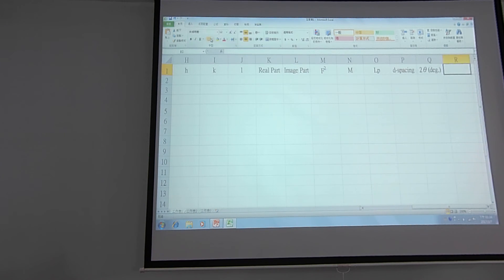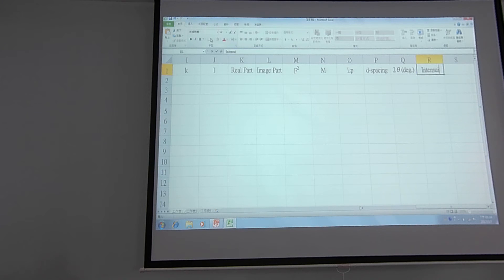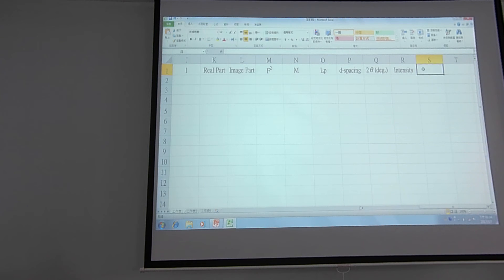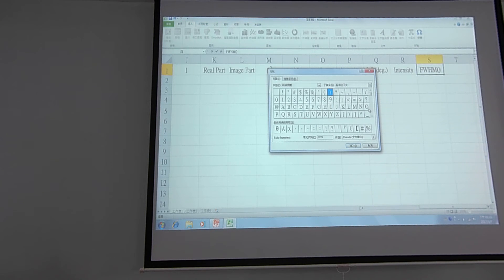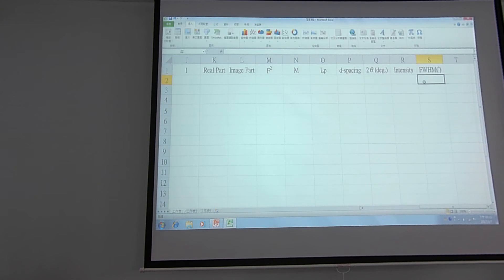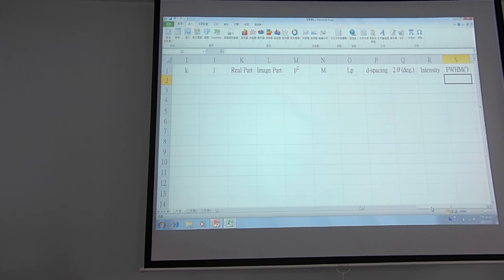The next two cells will be for intensity and half-width. For half-width we use the symbol FWHM — Full Width at Half Maximum — in units of degrees. I will insert the degree symbol.